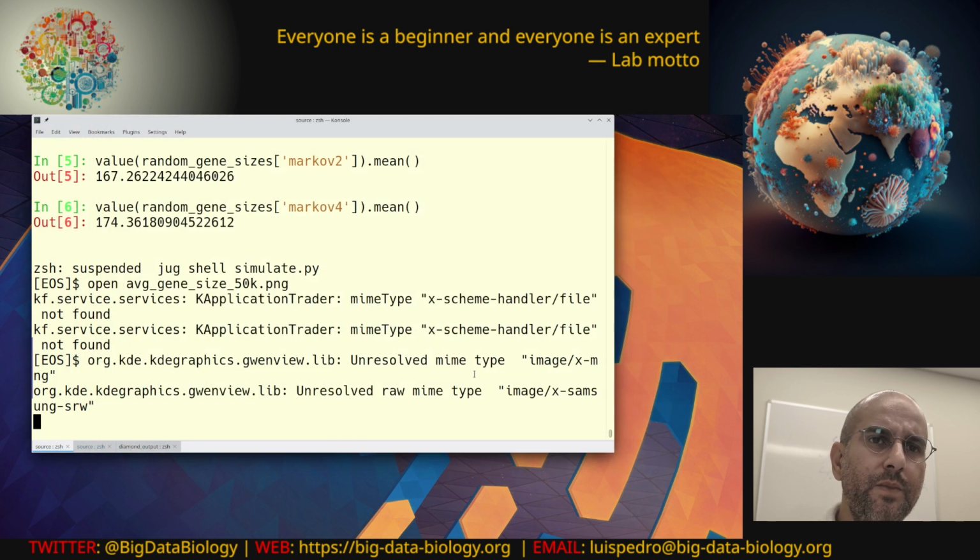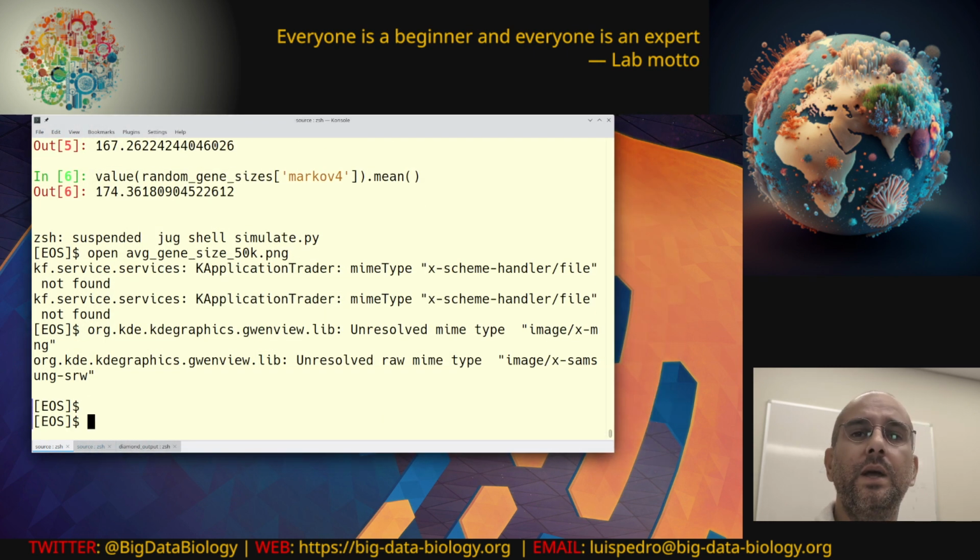So as I said, and I should have actually saved that, I'll run it again afterwards. I'll save the figures. So this figure where we see that checkM2 really is picking up this decrease in quality brought around by the indels and by small mutations. That was really nice to see. That was somehow where this project started.